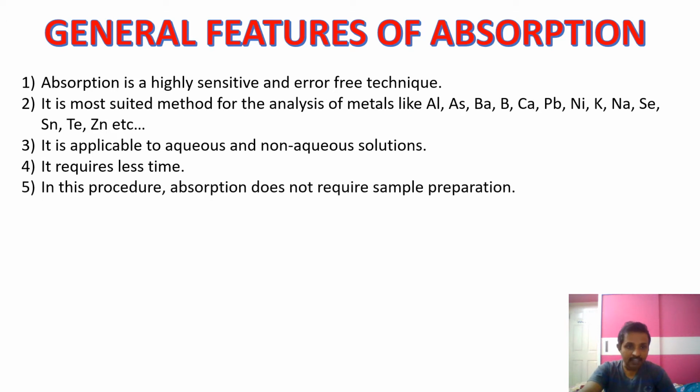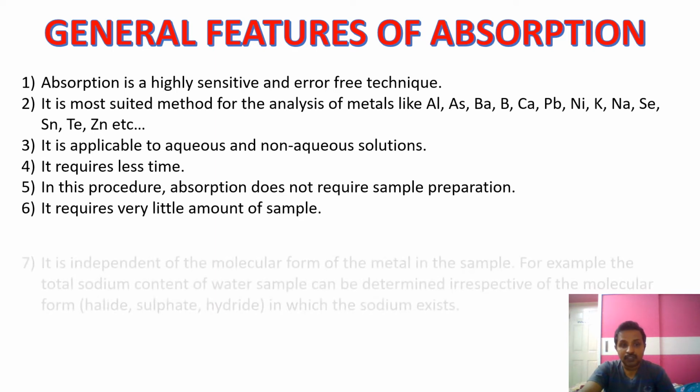In this procedure, the absorption does not require sample preparation; there is no need of preparing any type of sample. It also requires a very small amount of sample, because some of the samples are very costly, so a little amount is enough for the analysis of the compound.